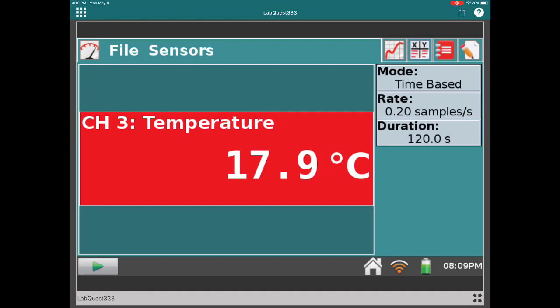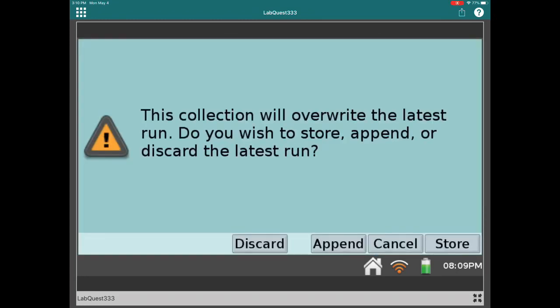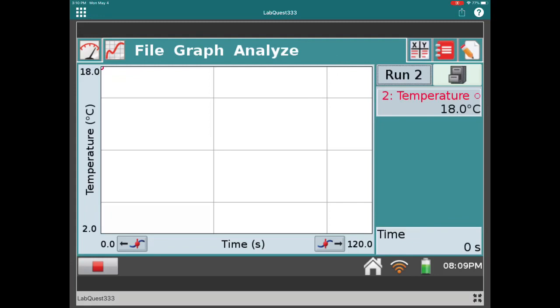The first three liquids we've looked at have been different forms of alcohol. Let's turn our attention to something a bit different — this next liquid is a mixture of hexanes. Take a look online to find the chemical formula of hexane and get a sense of its molecular structure and intermolecular forces. Just like before, we'll begin recording the temperature with the sensor immersed in the liquid. Now we take the thermometer out and let it sit on the countertop with the filter paper soaked with the liquid so the liquid starts evaporating.